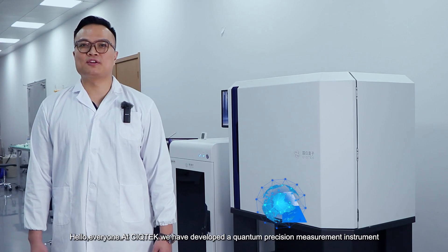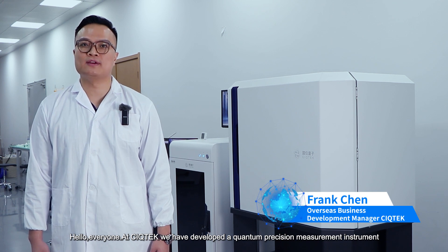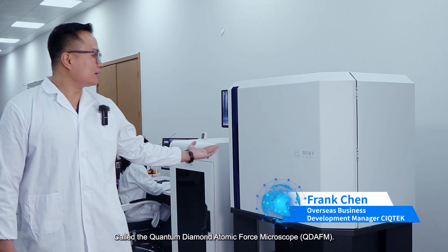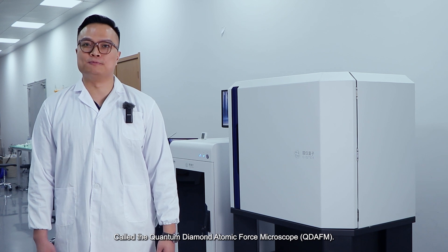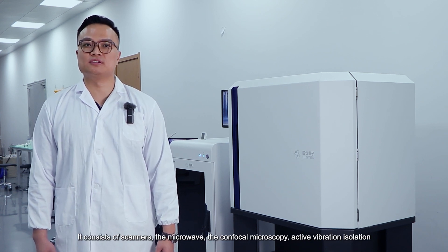Hello everyone. At CQTECH, we have developed a quantum precision measurement instrument called the Quantum Diamond Atomic Force Microscope.